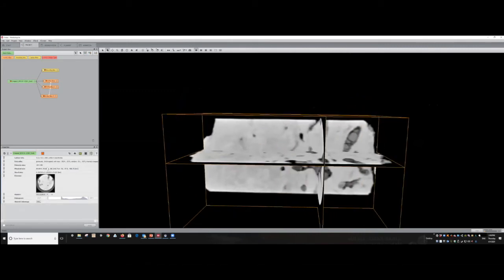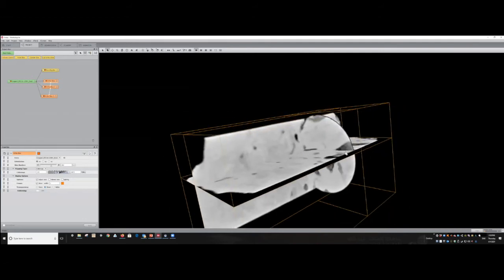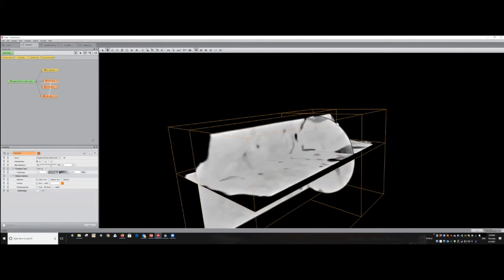So one thing just to explain is that the data range usually comes with the data. The user usually knows the voxel size and the intensity range, or you can find it. It comes stored within the data itself. I usually change the transparency to binary, so I can get rid of the black mask for each of them. You can see it as a whole object.